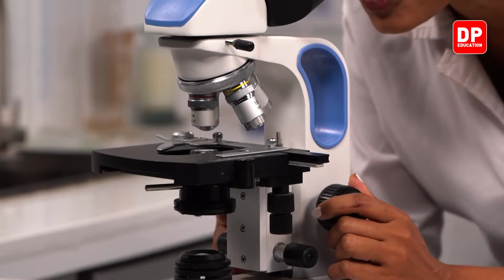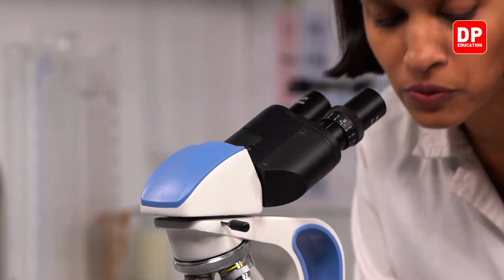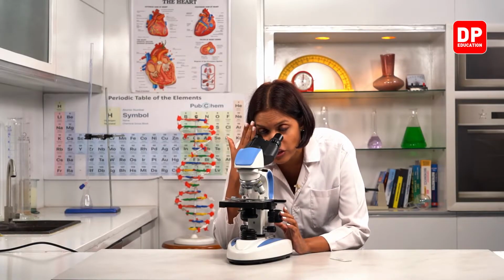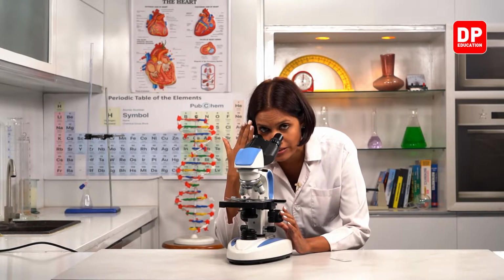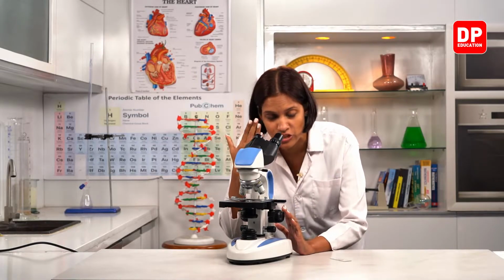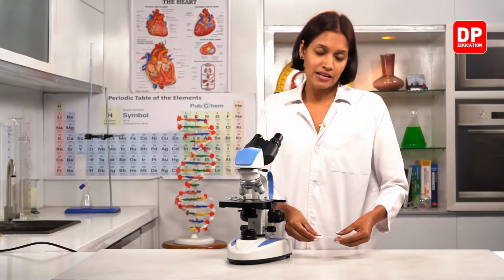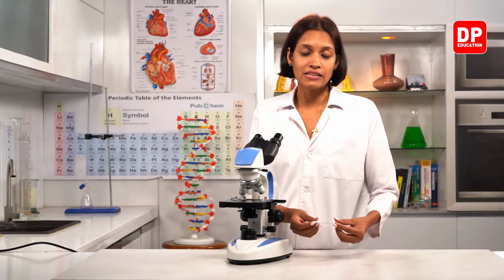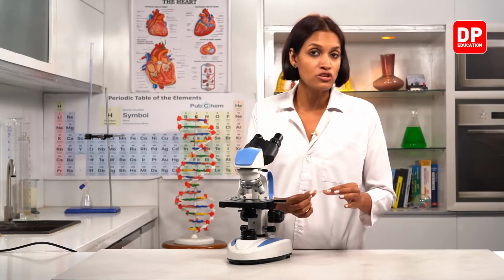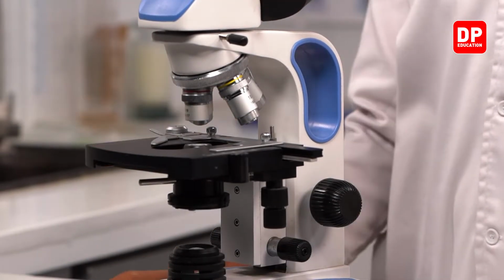Remember, when we look through the eyepiece, we have to make sure that both eyes are opened. Okay? Right. And you should not take your eyes too close to the lens. Eyes should be at least 1 centimeter away from the lens. Okay? Now we need to place this slide. Now I have a permanent slide here. This is our specimen, what we are going to observe, right? We need to place this slide on the stage.